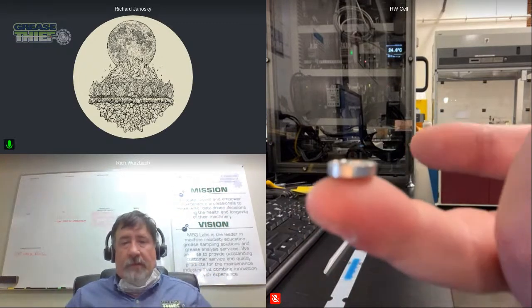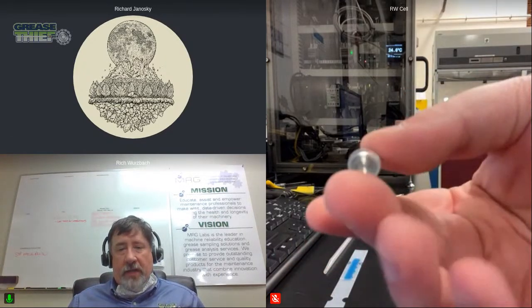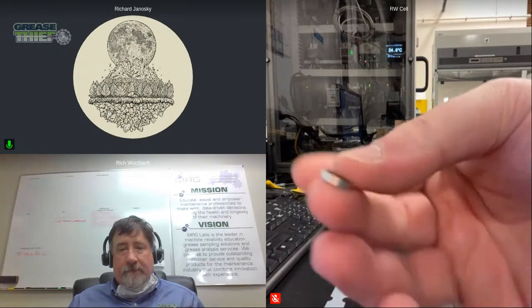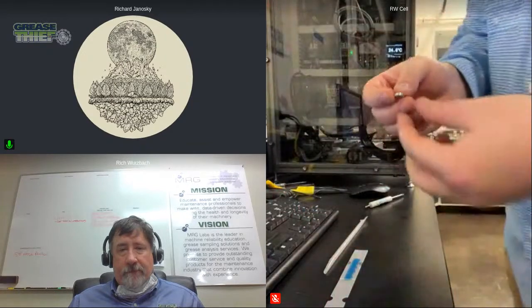And so the last thing you're showing us here is from this little cup, right, for the IR. So there it is on the side profile. It's a very thin little cup. You might have to hold it back a little bit. You're a little out of focus there, being too close, but yeah, there you go. It almost looks like a little disc battery, but it's a very, very thin cup. So this is for PAS.